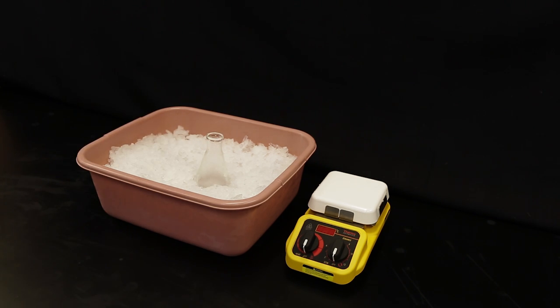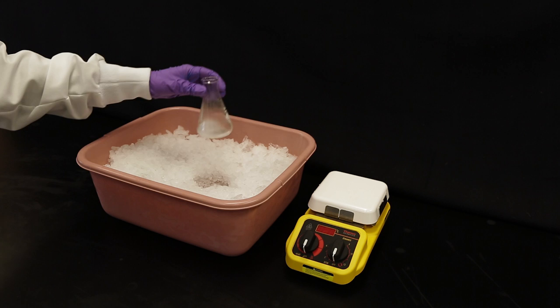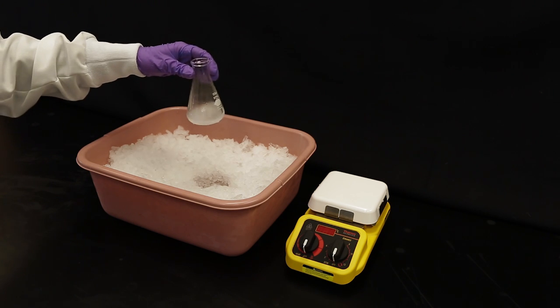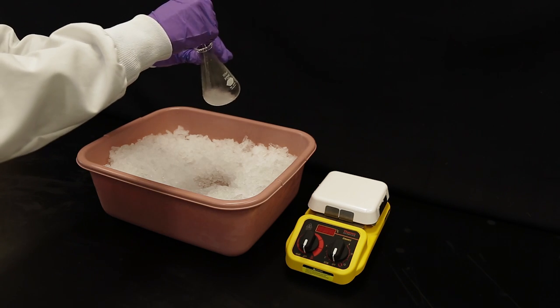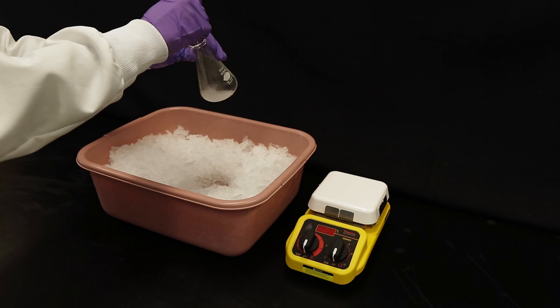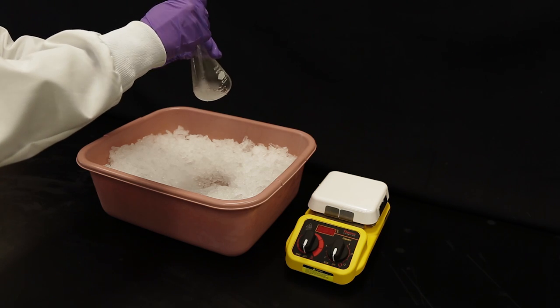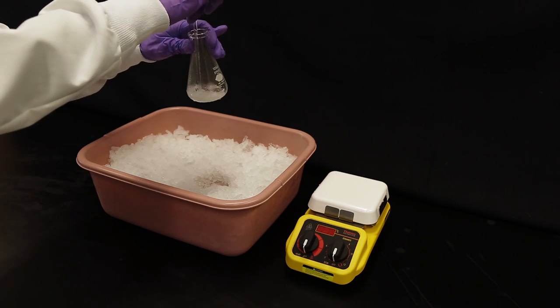Crystals need a surface to grow from. Glass often prevents this due to its smooth surface. To generate pure crystals, you must seed the supersaturated solution. There are two methods for seeding: adding a pure crystal of the desired compound with a spatula, or scratching the bottom of the glass vessel with a glass stir rod.